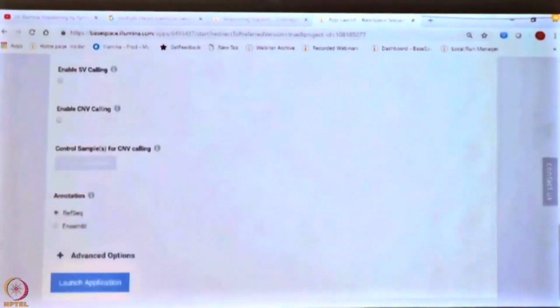There are many options because most of these algorithms come with multiple options that you can use to tweak the way the analysis is performed and the kind of results that are reported. We recommend for our new users, basic users, to use the default analysis. As you become more comfortable with the data that you are handling, you can play around with the parameter options.